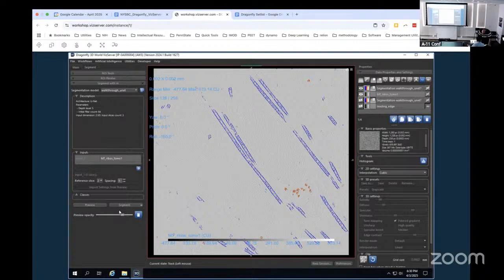Yeah, I wouldn't put this on. This segment. I don't, so that's what I was gonna ask. I think right? it's on the- It's the one that I- Anyone having issues? Still working. Okay. You create a new one, or did you use the same? I just use the same one. 30 seconds. That would be longer. Same network, so when you retrain. Hopefully it's getting more things.